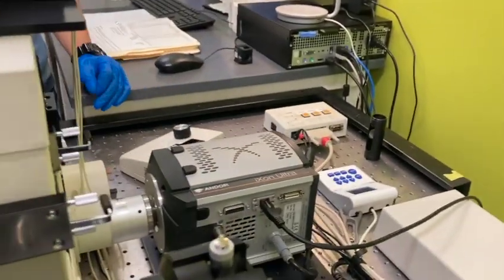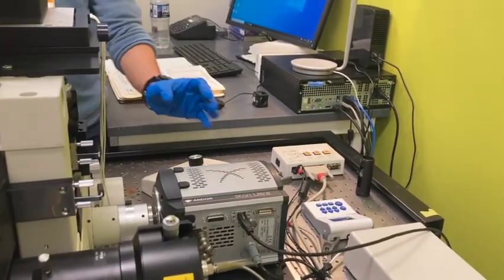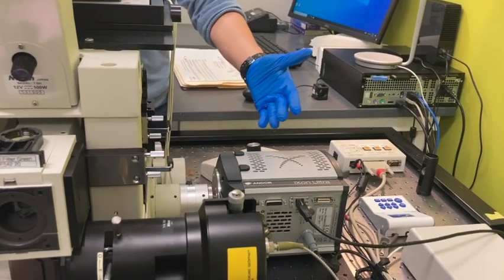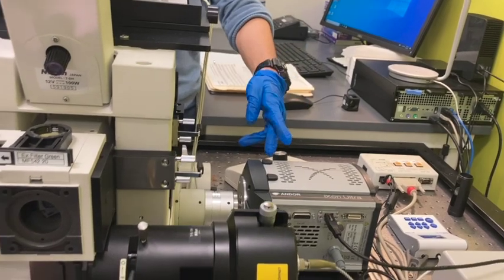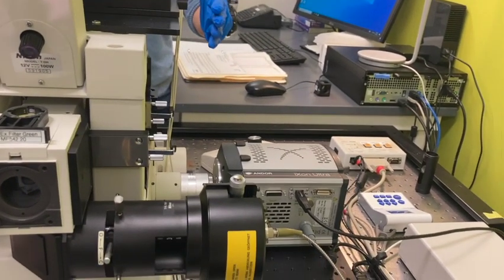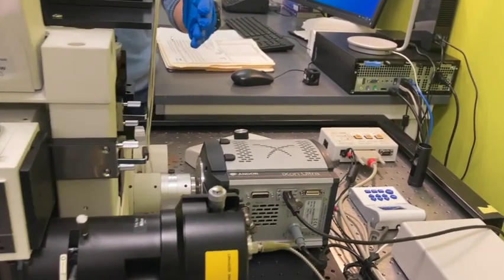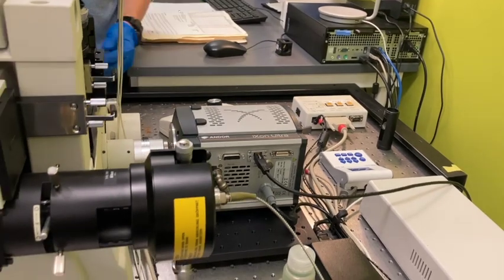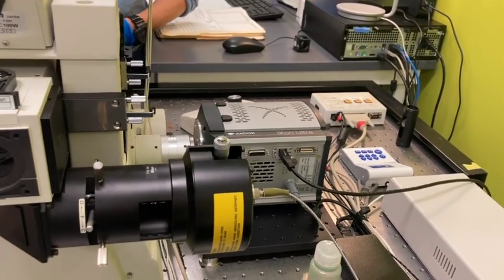The idea of turning the cooler off and then turning the camera off later is that if you suddenly turn the whole system off, the chip inside this camera could be very cold, and there will be condensation.